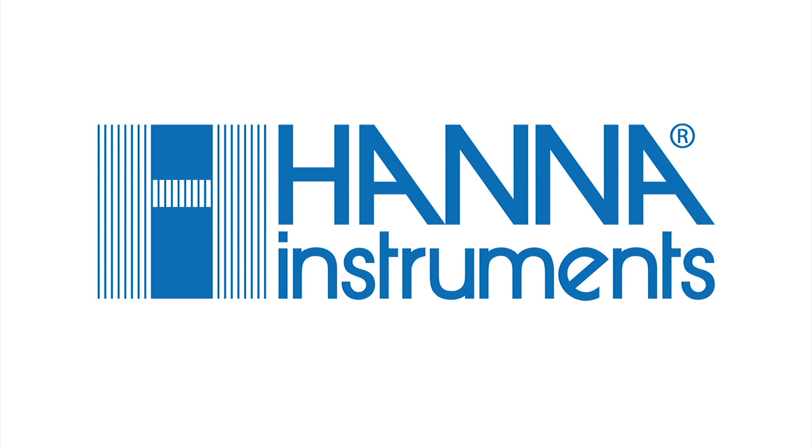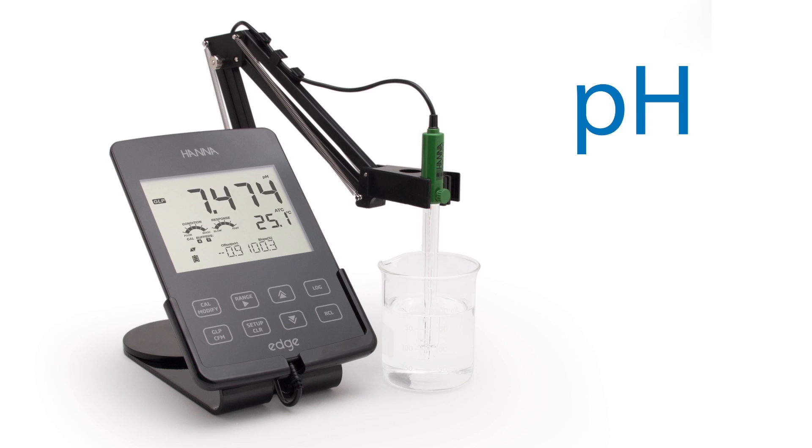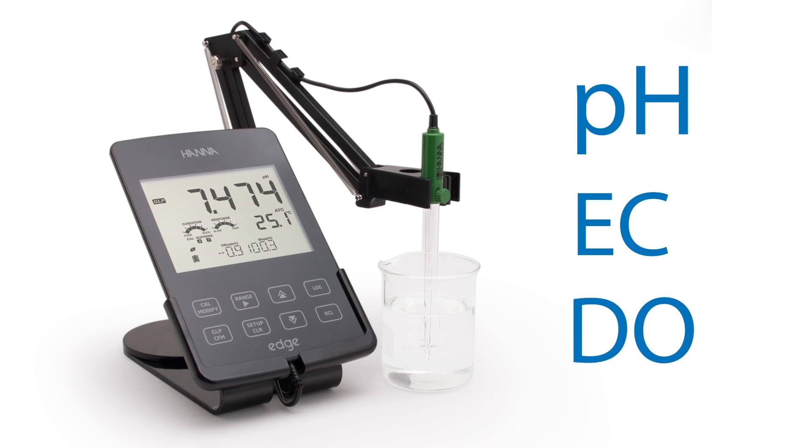HANA Instruments is proud to introduce the world's most innovative pH meter, EDGE. EDGE measures pH, conductivity, and dissolved oxygen through its unique digital electrodes.